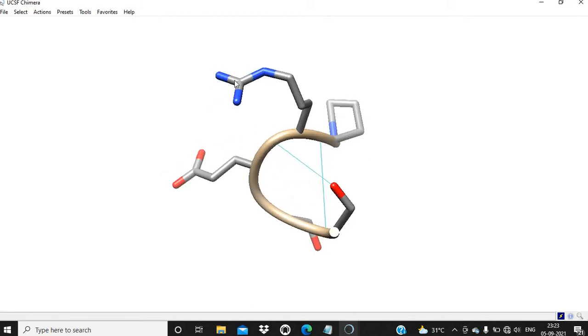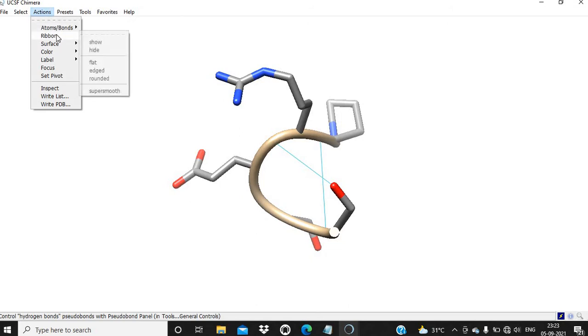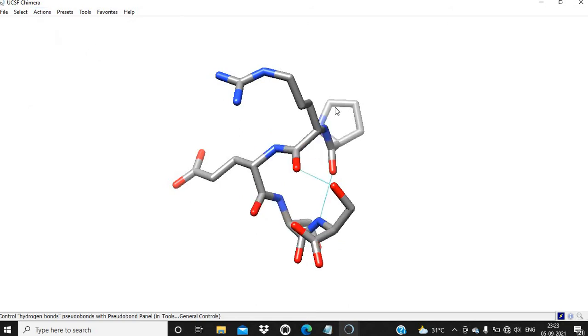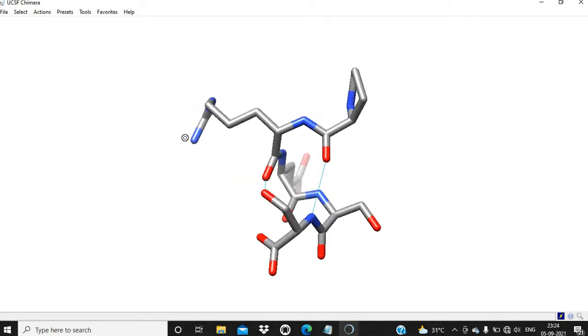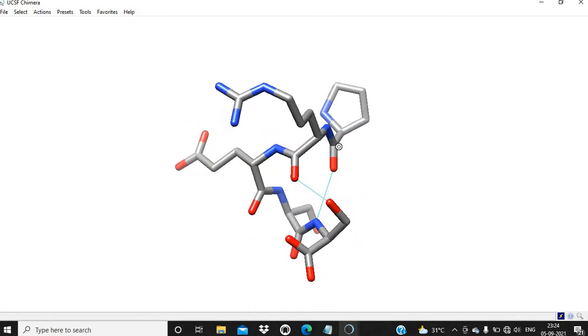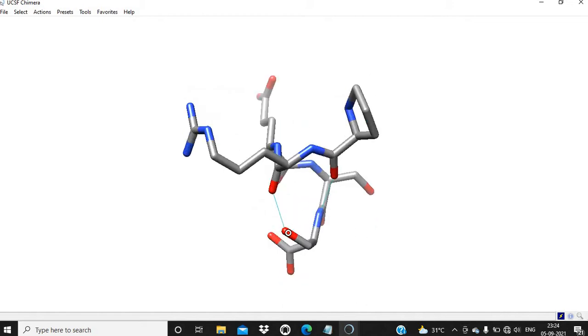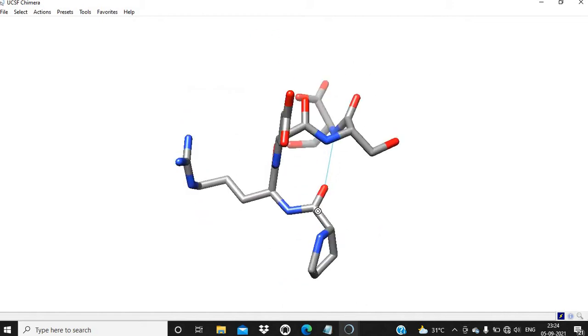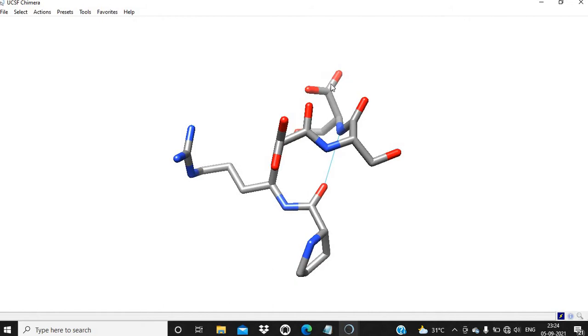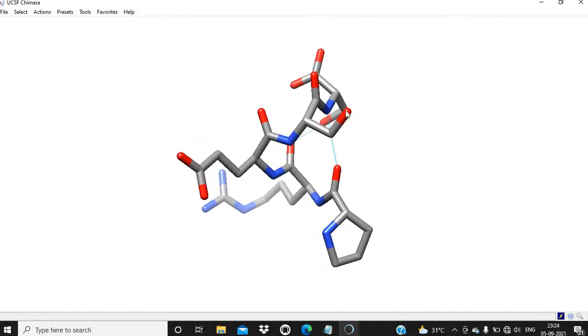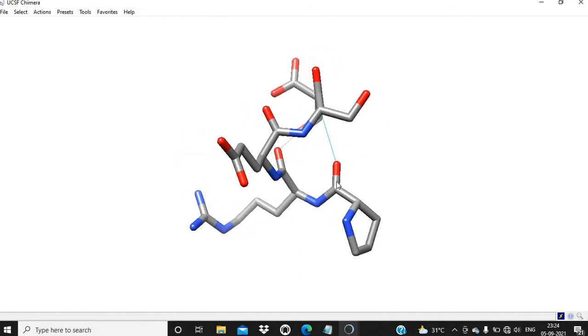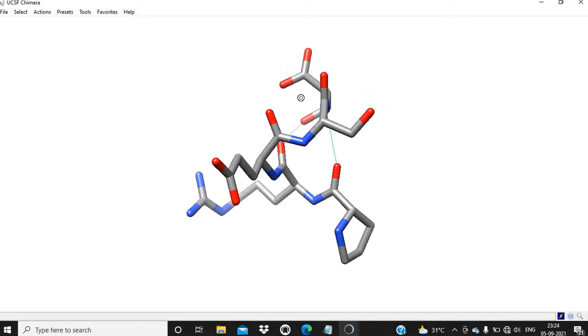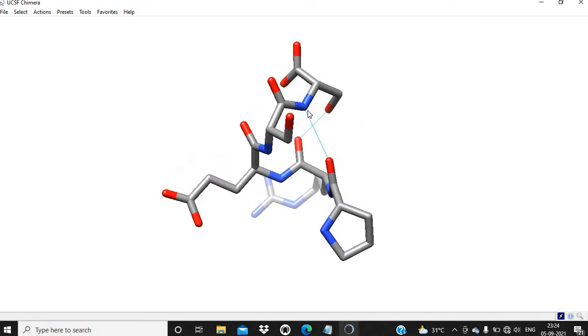Let's observe the backbone hydrogen bonds. Proline is at the N-terminal and serine is at the C-terminal. This one is i and this one is i plus 4th amino acid or residue.